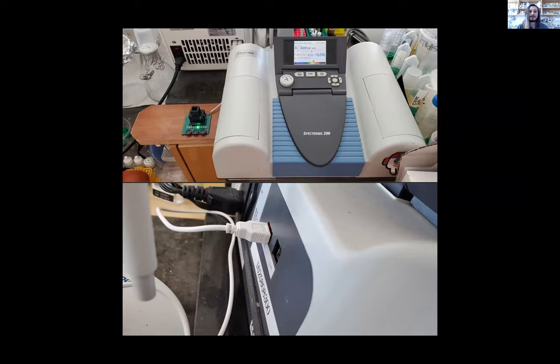And the coolest part, I was using my big spectrometer to calibrate and verify my little spectrometer, and I'm actually using the USB port in my big spectrometer to power my little one, so it's like parasiting off of it, which is really fun. The entire thing is essentially just trolling the massive cost of spectrophotometers and how we can better assess this from an amateur biology standpoint to do just the thing we need.